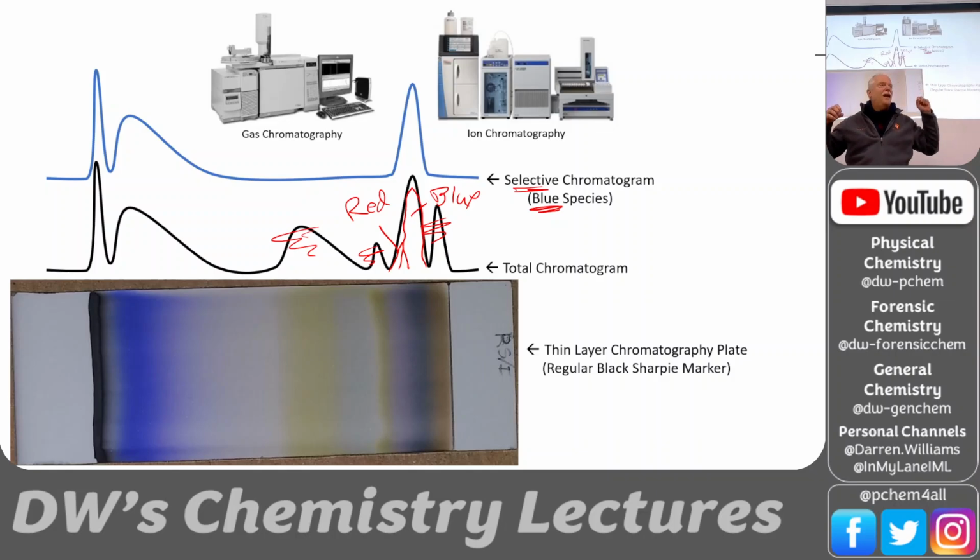And all of a sudden, this analyte comes puffing out of the end of the column, and it goes past that wire, and the electrons go, this atmosphere is different, and so the conductivity of that wire will change slightly based upon the gas that's around it. So that's how a thermal conductivity detector works.